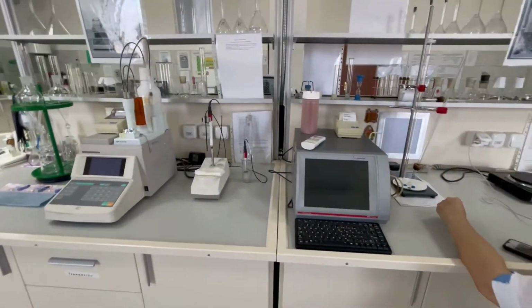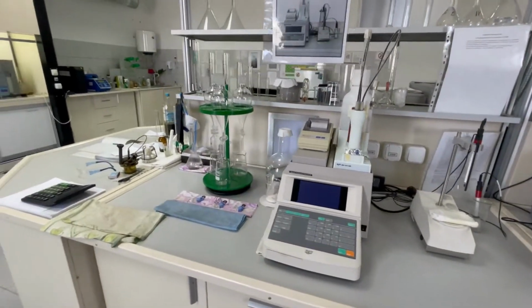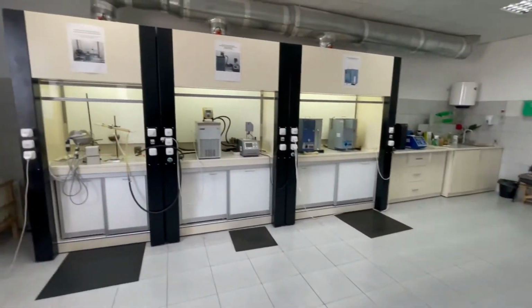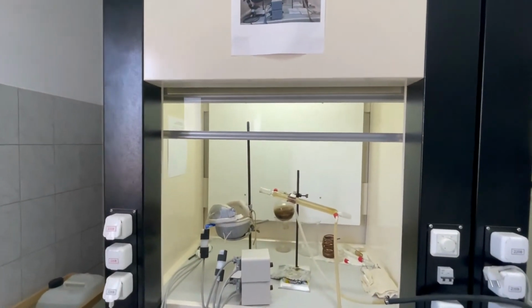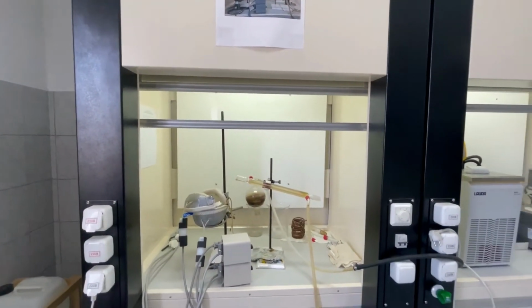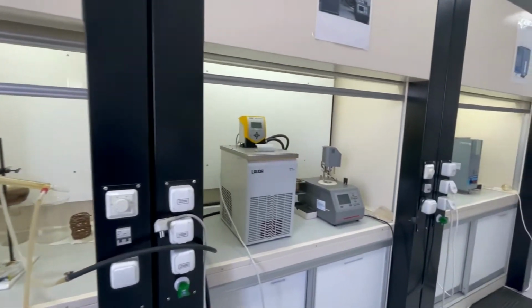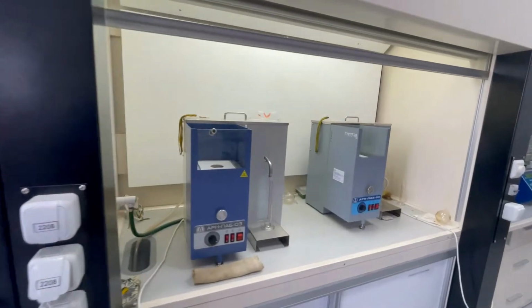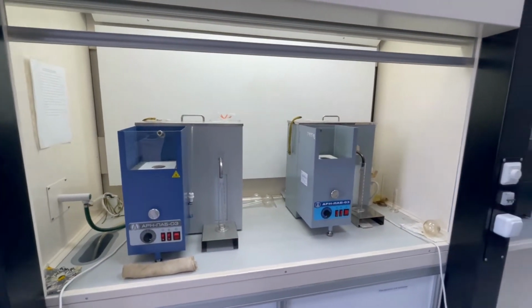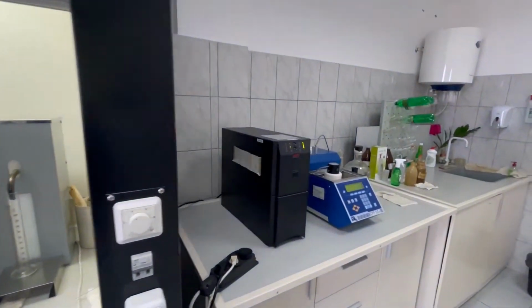Here we have a density meter and the automatic titrator. And here we perform the analysis of chlororganic substances. Here's the flash point and the fractional composition of an oil and freezing point.